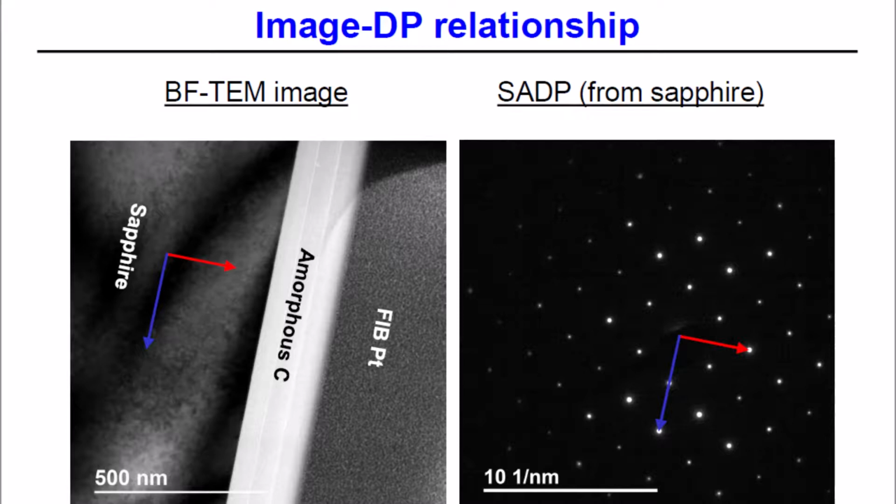The other good thing about the Tecnai is that the rotation of your diffraction pattern basically has two different regimes. So basically there's a cutoff camera length where above it I have a constant orientation that doesn't change, but if I go below it, there is a rotation to the pattern. But if I go lower than that, I don't see any change in the orientation.